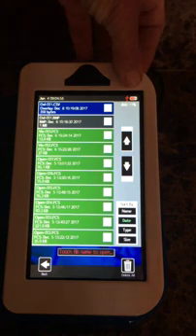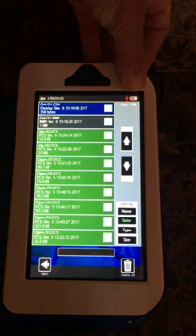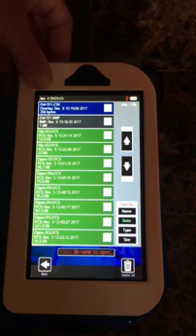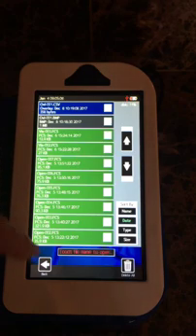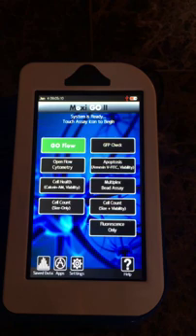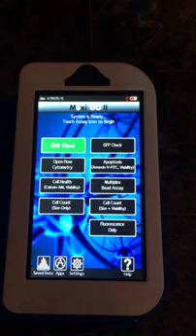The instrument is battery powered, however when running an experiment it should be plugged in — the battery indicator is up here. We date and time stamp each file, and each file gets automatically named. In a later video I'll show you how to rename those. That's it for the basics, and we'll have additional videos to show you how to use the instrument.